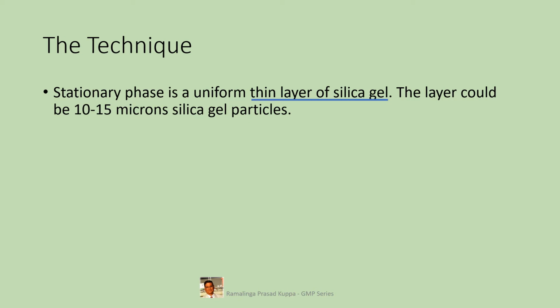It means the silica gel stationary phase is sensitive to 254 nm UV wavelength, and spots that are not visible in visible light can be seen using a UV viewing cabinet with 254 UV light in it. But be careful with the UV light chamber. Never stare with the naked eye at the UV lamp when it is glowing. It can damage the retina of your eye.